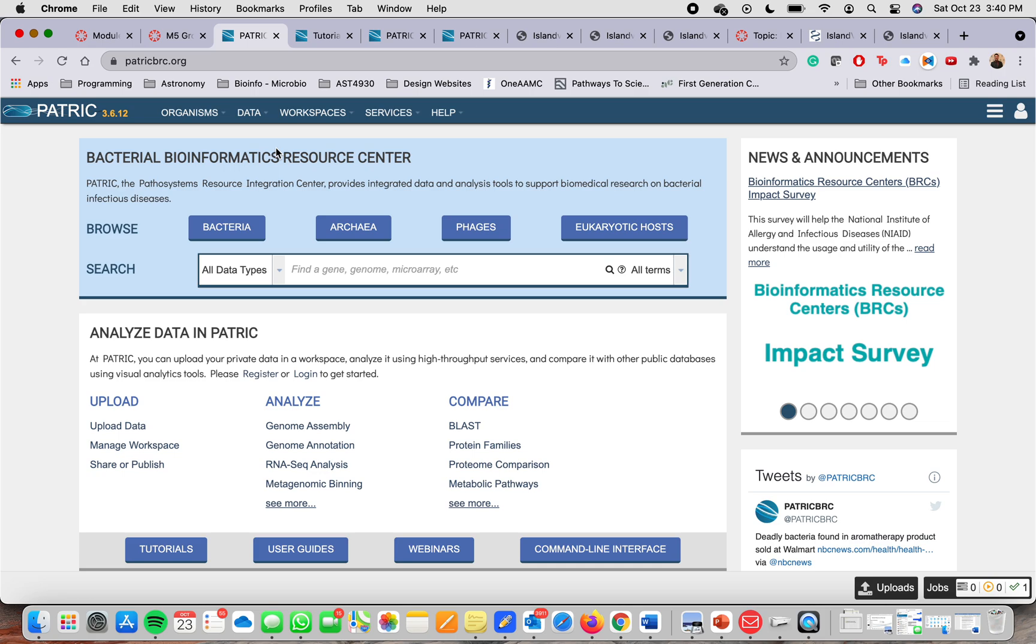It will provide integrated data and analysis tools to help you do research or biomedical research.